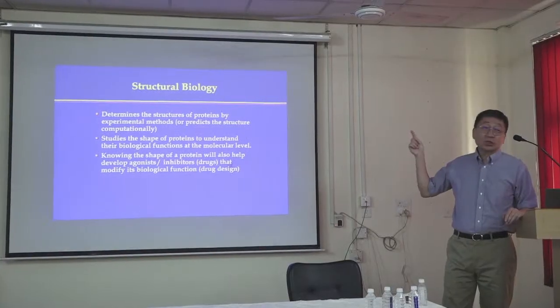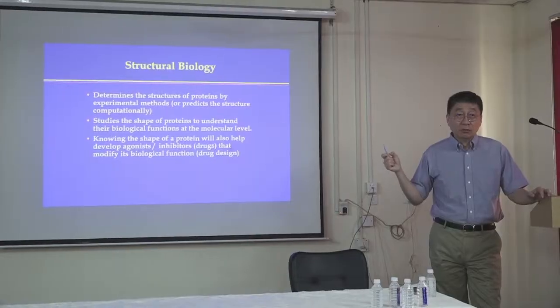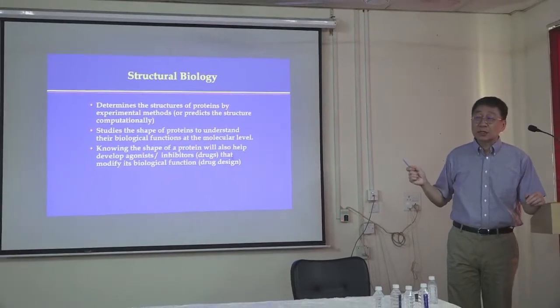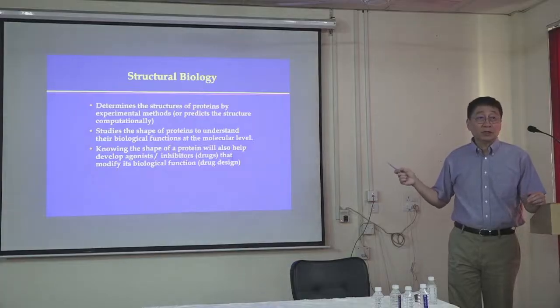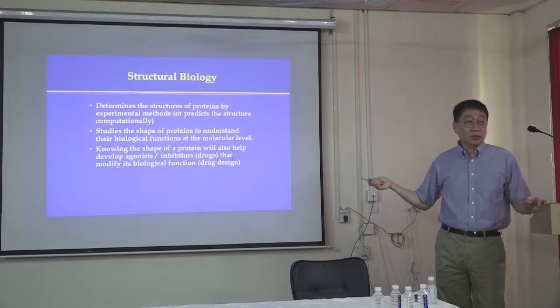So the idea is to use experimental technologies, crystallography or cryo-EM, to determine the structure, and use structure, the second bullet point, to understand function. And the third point is using structure to design better compounds or inhibitors, whatever it is, in a pharmaceutical or in an academic setting, structure-based drug design, essentially.